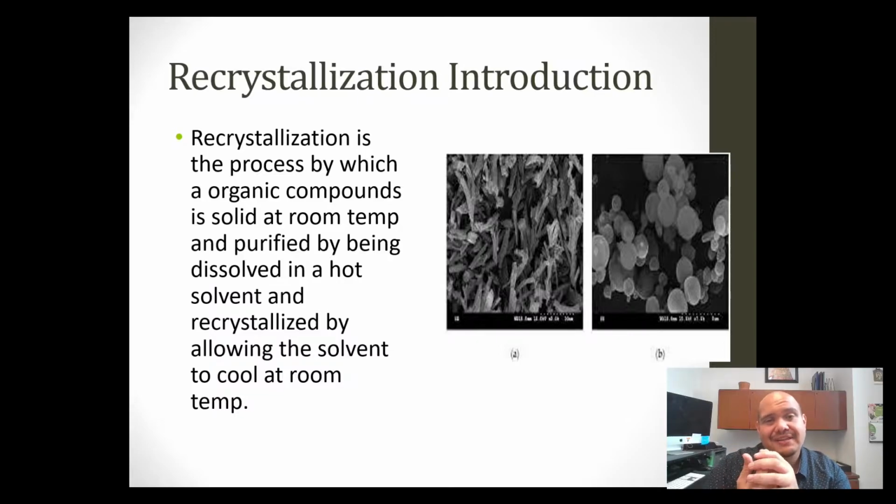Rather than going slow and steady and growing your crystal lattice over time, you'll cause an ice shock for the seeding crystal's lattice to encapsulate impurities and trap them. In which case, if you attempt to recrystallize something and you ice shock it, you actually trap the impurities right back where they were, and you now have an impure crystal again. So recrystallization, crystallization, and precipitation are three very different things, and what we're focused on is recrystallization.